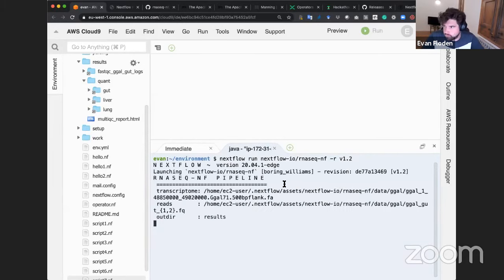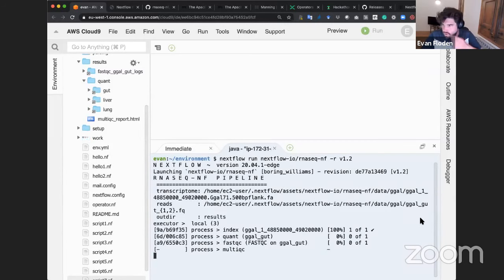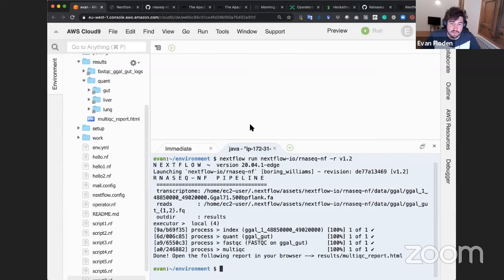Another question, can you use a local GitLab server? Yeah, so you can use any Git-based system that is out there. So there's support for GitLab, Bitbucket, GitHub, and I think there's actually a couple of others, Gitea. So this is a couple of open source versions of Git hosted systems which you can use. And this is exactly the approach that we have in terms of using with Nextflow Tower.